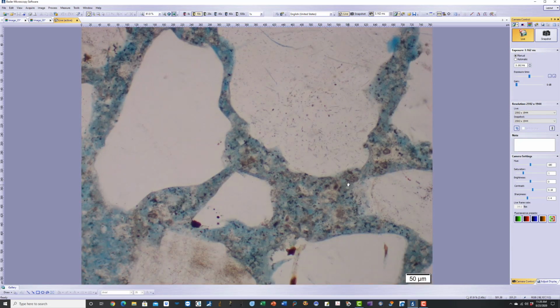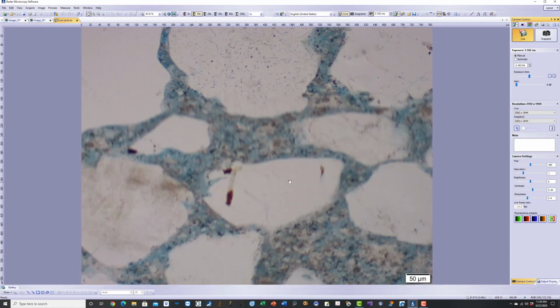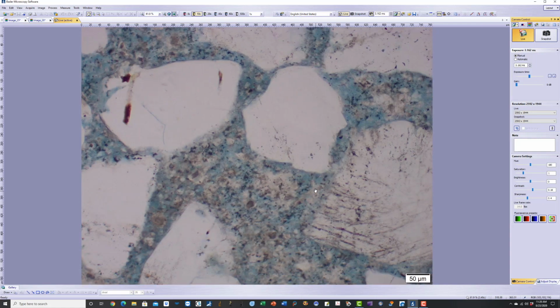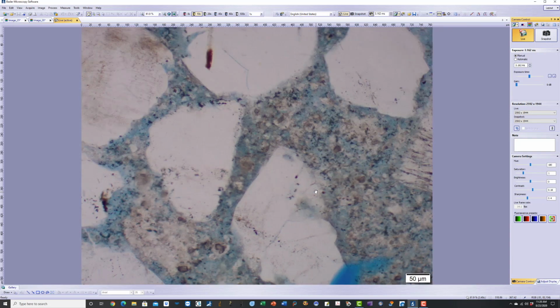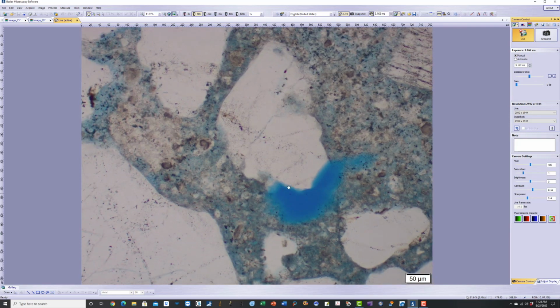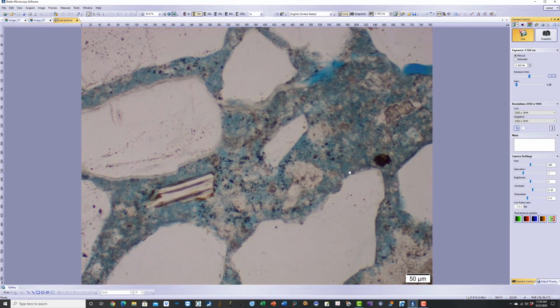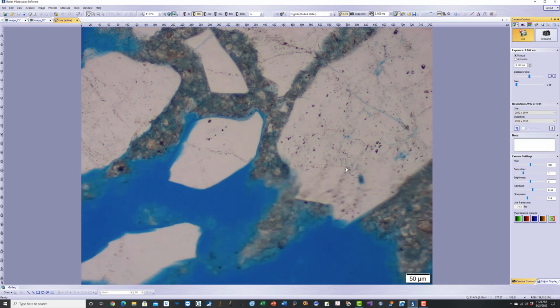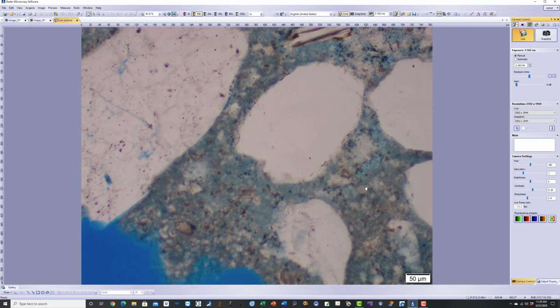But as you go deeper and deeper into the mortar, into the jointing mortar, you see lesser and lesser evidence of leaching and more denser paste with intermittent patches of lighter paste due to local high water cement ratio. You can see the hydration rim around residual cement particles. This mortar is just a two-component mixture of Portland cement and silica sand at 1 part cement to 2 parts sand by volume.